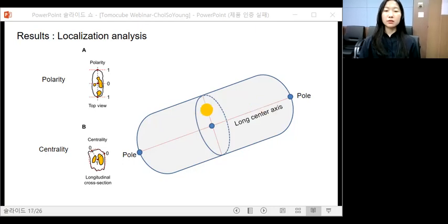And the other factor, centrality, indicates how close the PHA granules locate from the cell center. It is defined as the ratio of the distance of the PHA granules from cell membrane to the distance between the long center axis and the cell membrane at its cross-section here. Based on these definitions, polarity and centrality have a range of 0 to 1. And the higher polarity and centrality indicate that the PHA granules are located near the pole and long center axis of the cells respectively.